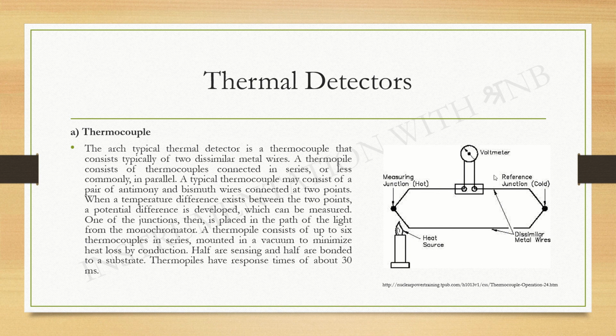So when there is a change in this voltage due to the analyte, it will be measured using the voltmeter. And also, when thermocouples are connected in series, they are known as a thermopile. And the response time of a thermopile is less than a thermocouple.